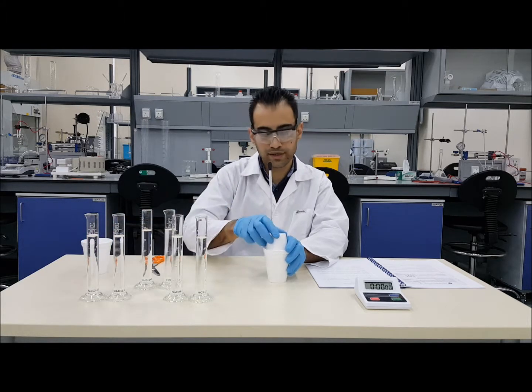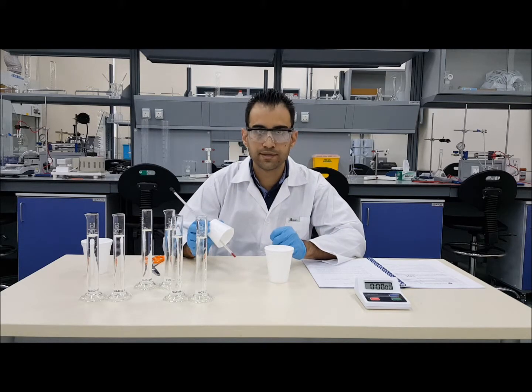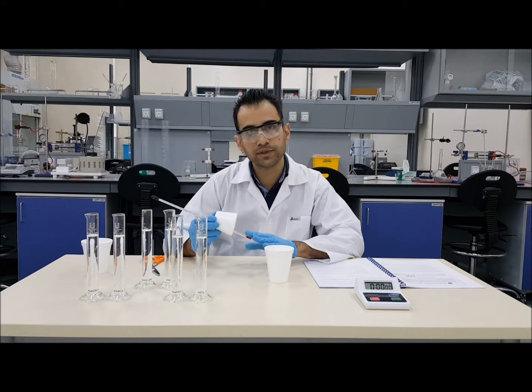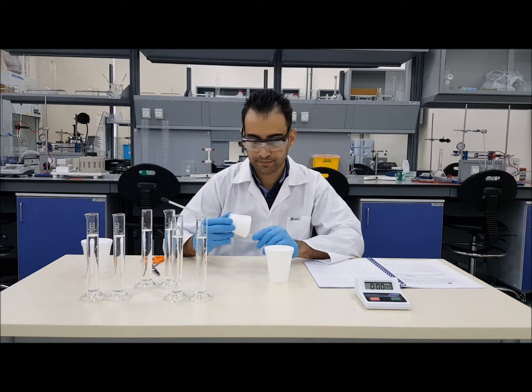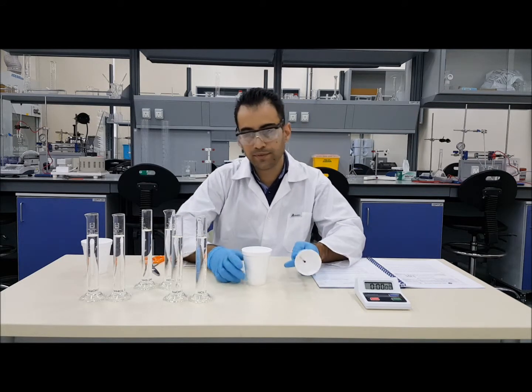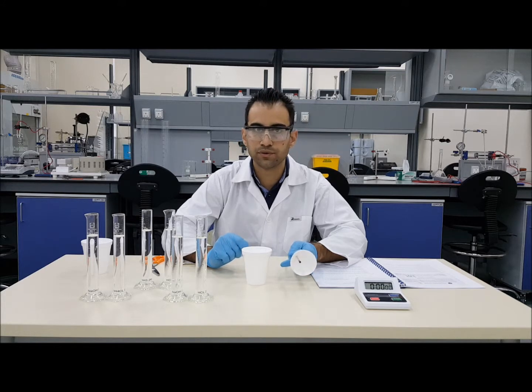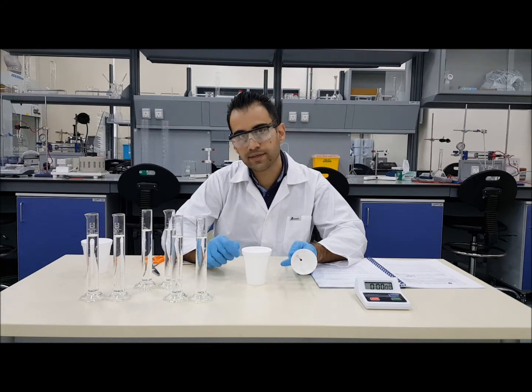Before you start with the experiment, you will need to get the temperature of both chemicals. You can use the same thermometer for that purpose, however, make sure that you wash it and dry it every time. For this experiment, as the chemicals are being prepared and stored indoors for you before you come to the lab, you can safely assume they are at the same temperature.